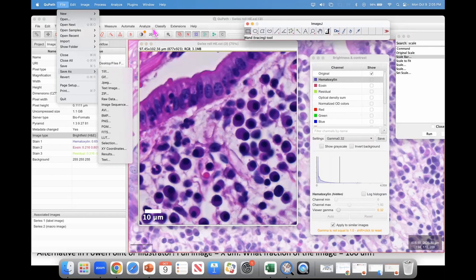One thing to point out: this image has 800 by 900 pixels. Have you heard of that moment when you're ready to publish and the editor says your images are not of sufficient quality — you need at least 300 DPI? Pixels per inch is an equivalent of DPI. So an image that has 900 pixels — how large can it be on a printed sheet of paper? About one to three inches. That's the conversion.